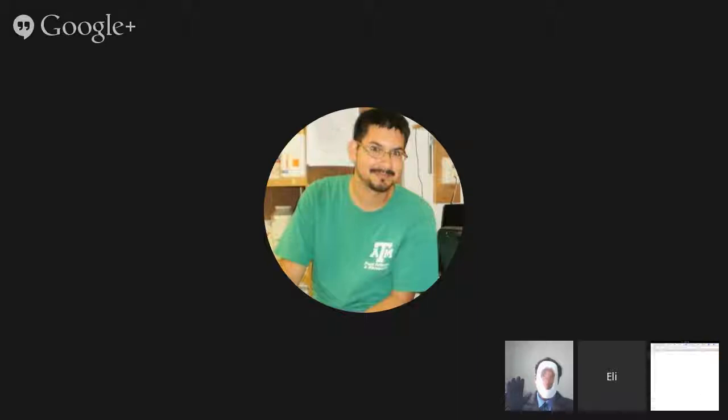Okay, thanks. Yeah, so here, just stop me if y'all know all this stuff and you want me to skip it, but that's the FASTQ file. That's basically what they couldn't demultiplex. There's a little spreadsheet showing some numbers of reads and stuff that are in each of the groups that they consider. And then here are the FASTQC files generated for each undemultiplexed or demultiplexed group of samples. And these correspond to these here.